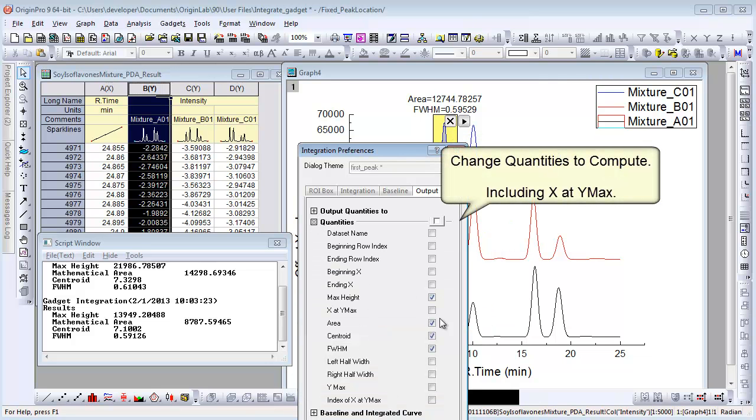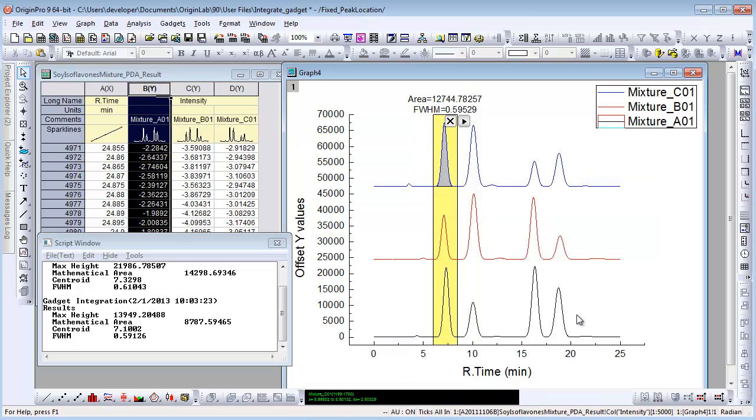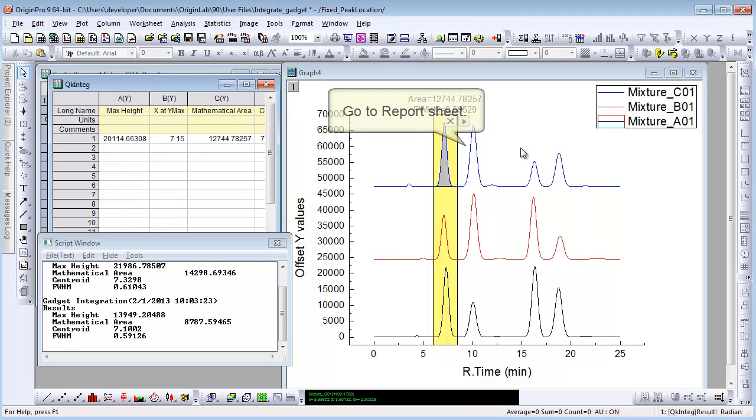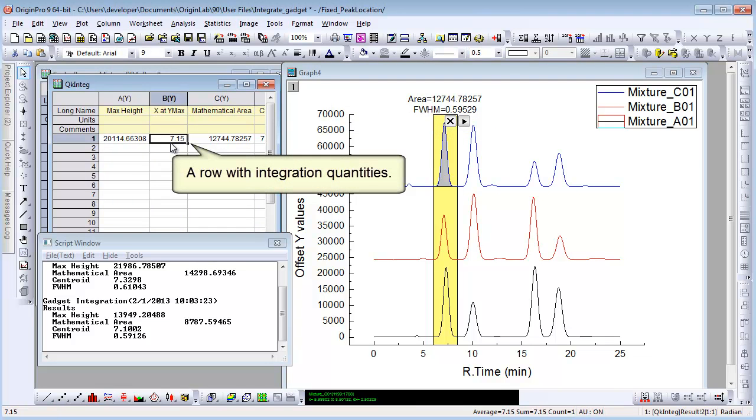You can also change the quantities to compute. For example, check X at Y maximum. Now let's output again and choose Go to Report Worksheet. A row with integration quantities show, including X at Y maximum.